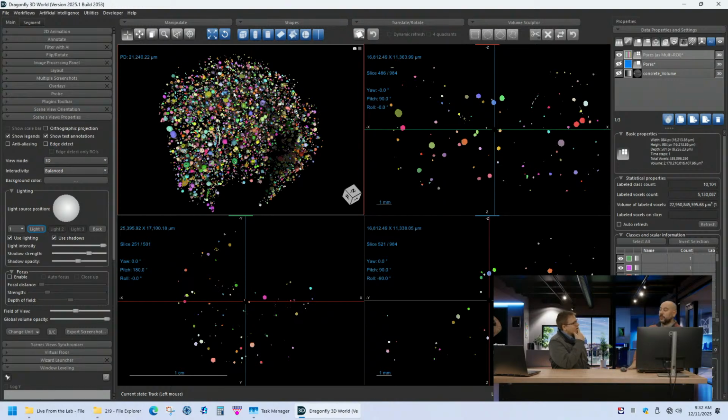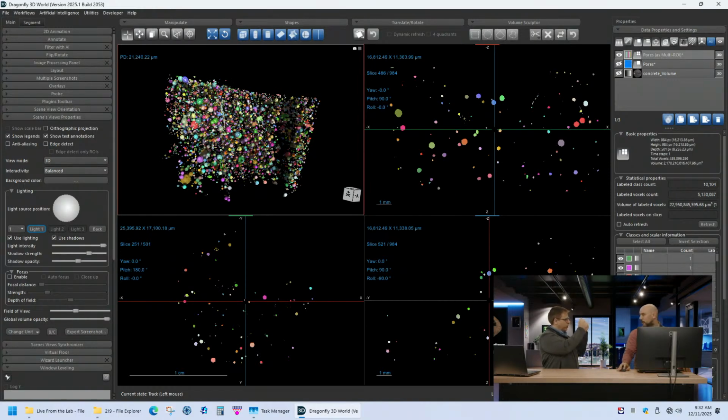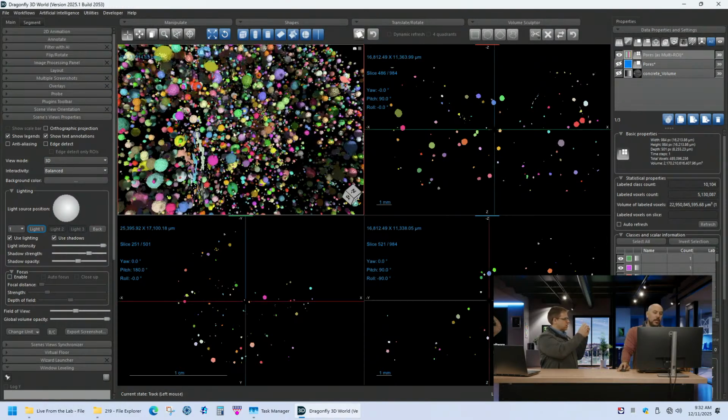Not necessarily, because we're still only on identified volumes. We haven't done any computations yet. It's almost like a secondary segmentation. The first segmentation said these voxels are pores, but they're not necessarily connected to each other. Now it said these voxels of this pore are one pore. All it's done at this point is identify or segment. This is one pore, this is a separate pore. It knows these are separate volumes. Exactly. Now how do I do that next step where I can determine the size?